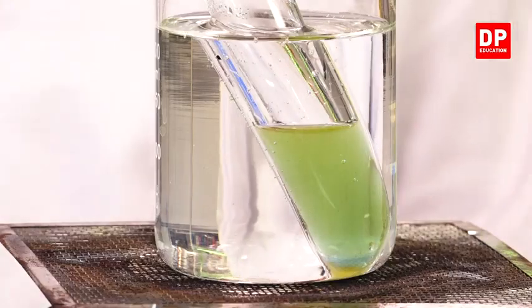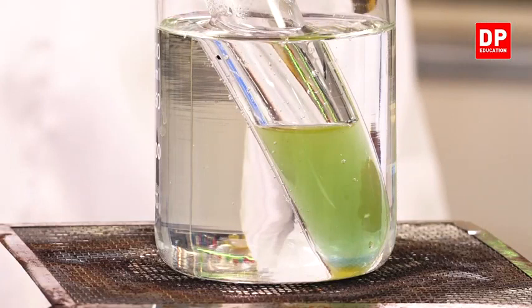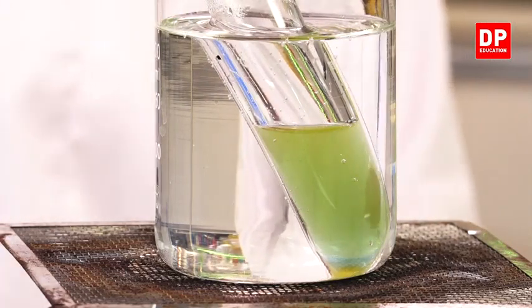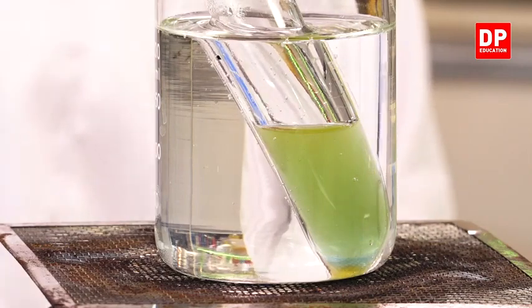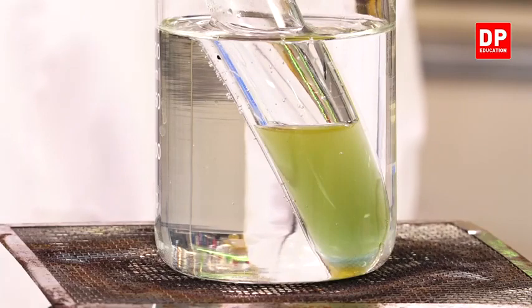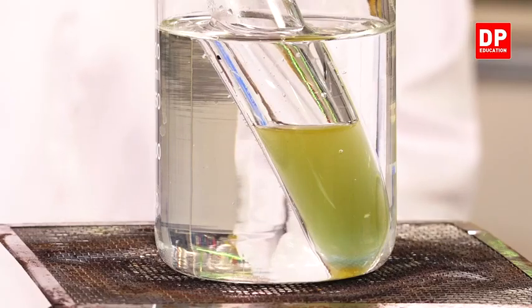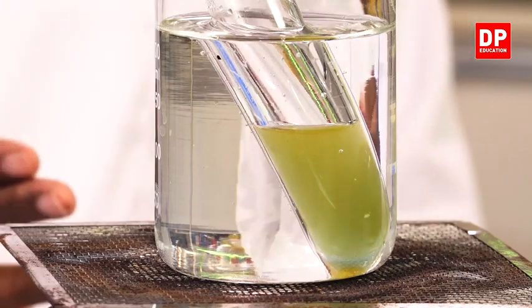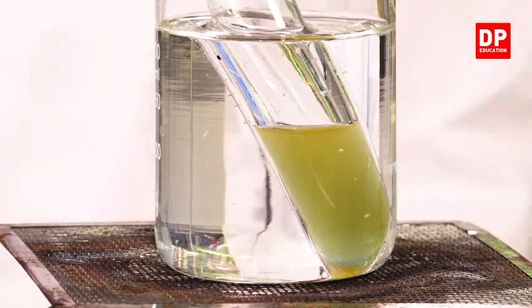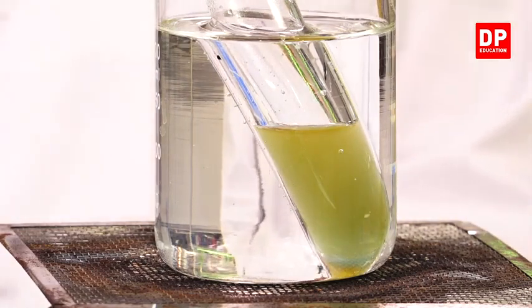You can see the solution changing color from light green to a yellow-green color. Now you all can see the yellow-green color becoming a little more darker.